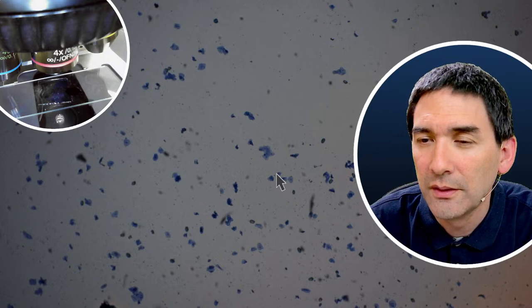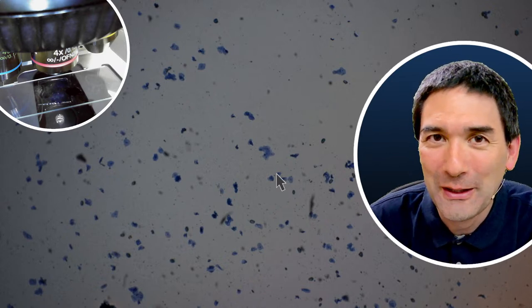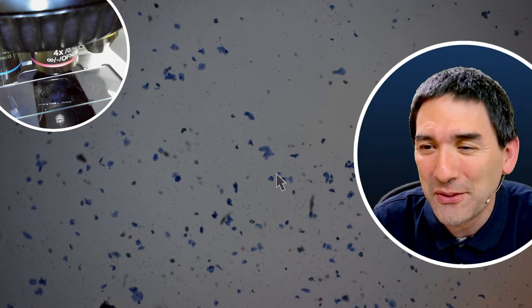Can we also do an analysis of dog saliva versus cat saliva? Sure, you can try everything, but usually when you take samples like this, you're going to find so many different things on there, it might be difficult to identify what you see.